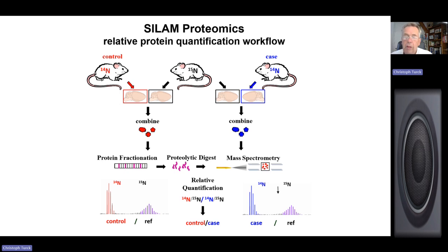What you should not do if you have 15N labeled material at your disposal, and you want to compare two conditions, control and case, let's say an untreated animal and one treated with a certain drug, you should not directly compare them. In other words, you should not mix plasma, for instance, from the unlabeled control animal and plasma from the 15N labeled case animal, because you can never exclude, first of all, an isotope effect, and secondly, that the 15N diet might be a little different from the unlabeled diet.